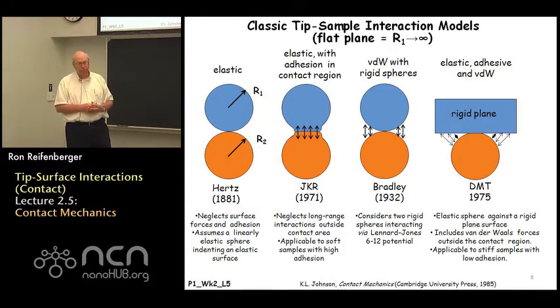In particular, the DMT model focuses on the sphere-plane interaction, so it's a model that tends to be used very often in discussion of atomic force microscopy.